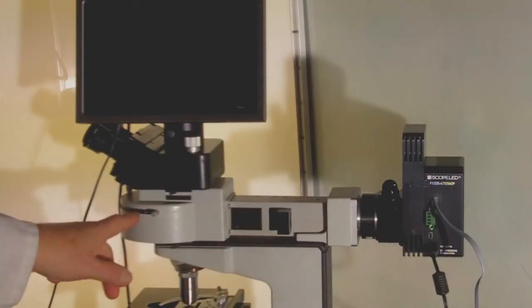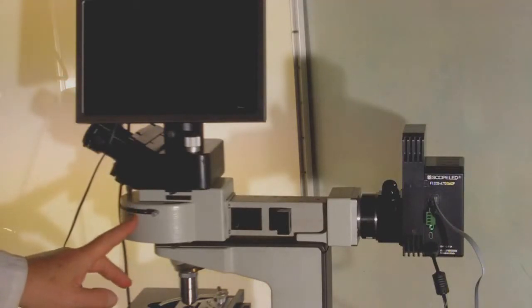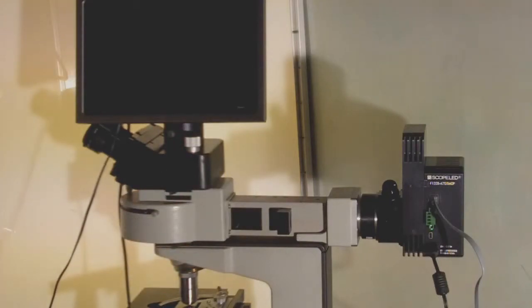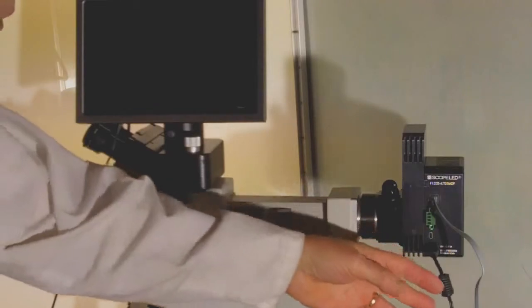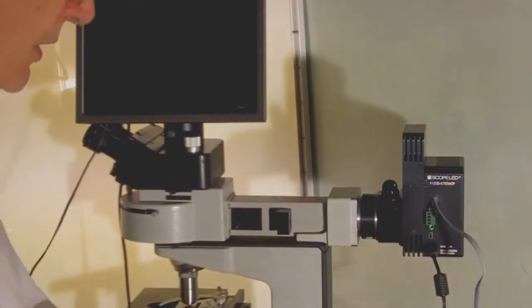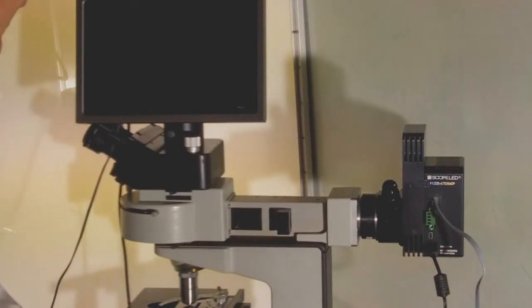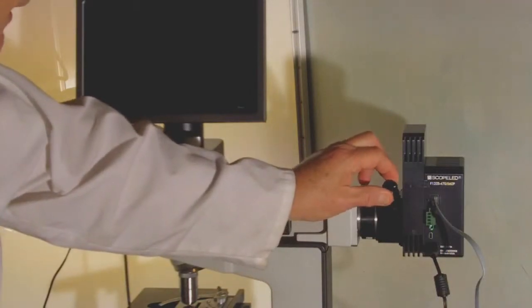Built into the Plume illuminator are the standard filter cubes based on the fluorochromes that you'll be working with. The F-Series Scopeled is made in America. It just requires a standard AC-DC power supply that comes with it. The unique feature about this lamp housing is the built-in collector lens.